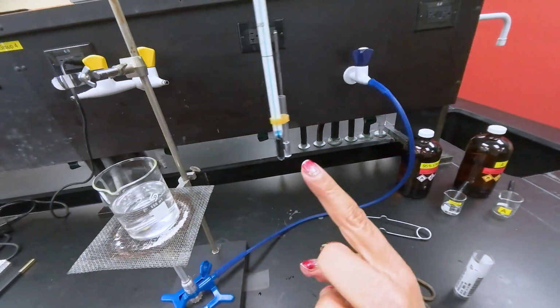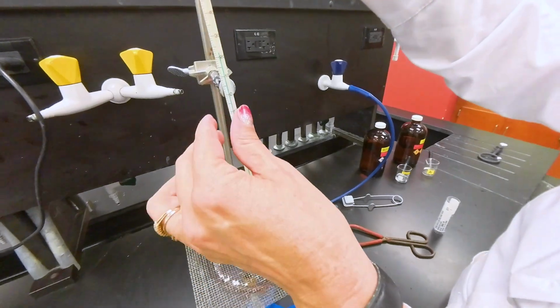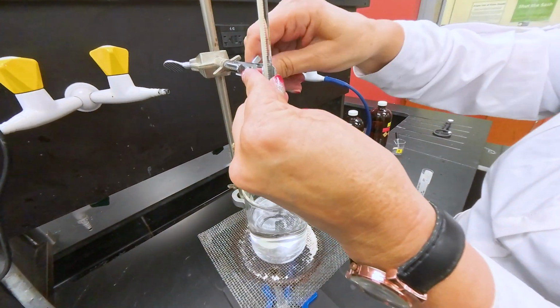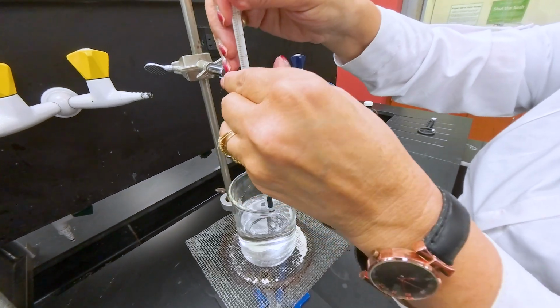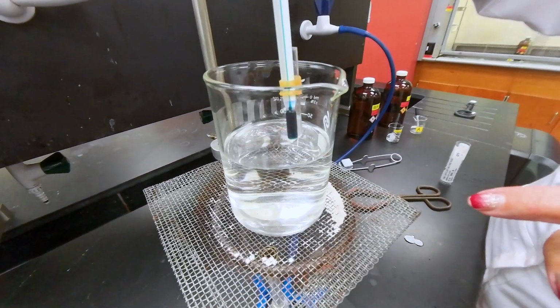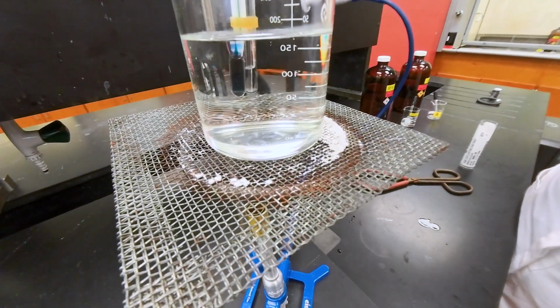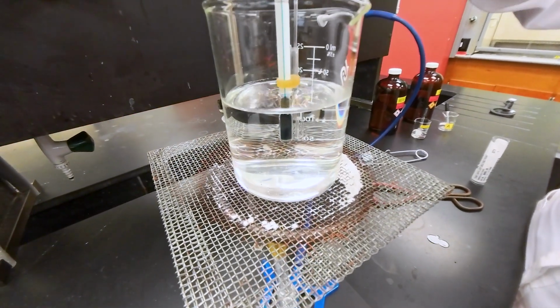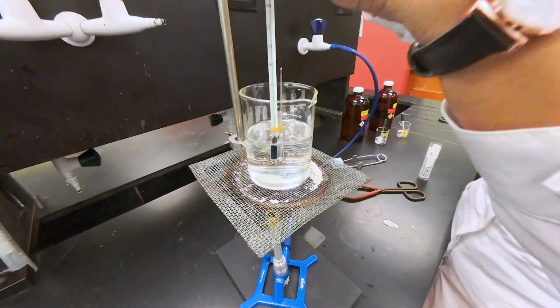I place the entire setup of the thermometer in the hot water bath, inside the water. How low it should go: I want to make sure that the sample is immersed in the water, and I don't want it to touch the bottom of the beaker, which is the source of the heat.